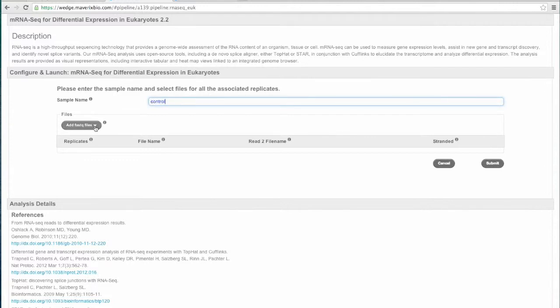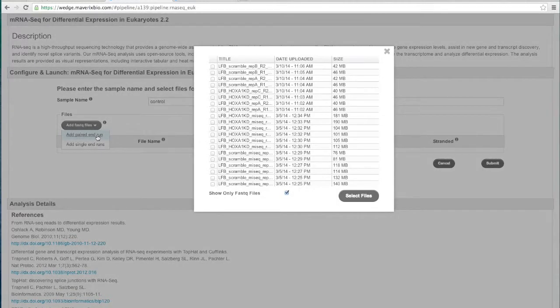So I'm going to call this first one Control, and then I would click Add FASTQ Files. Here you have a choice of selecting paired end or single end runs depending upon the data that you're going to be uploading. If you do have single end runs, you can pick all of the replicates that are associated with this particular control sample all at once from the next pane that you'll be seeing here. For paired end runs, you have to actually select these 2 at a time so that they stay associated with one another throughout the analysis.